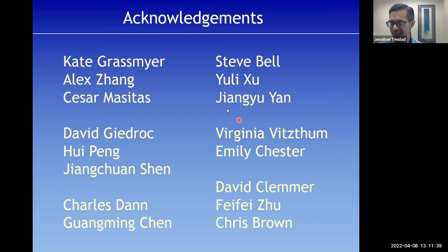And so instead of having the necessary 1 million copies of a given crosslink, you might have 100 copies of 10,000 different crosslinks, right? And so they're there, but you can't see them by mass spec. So the problem I think you'll have is actually seeing crosslinks in the first place, not trying to decide which of your crosslinks were randomly associated.